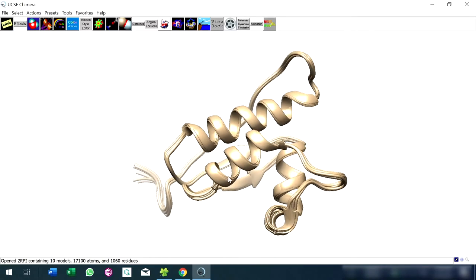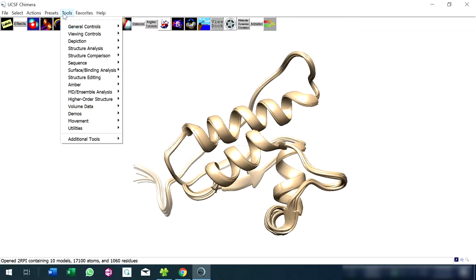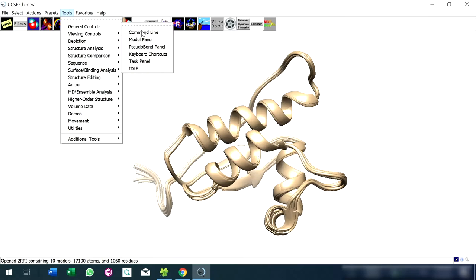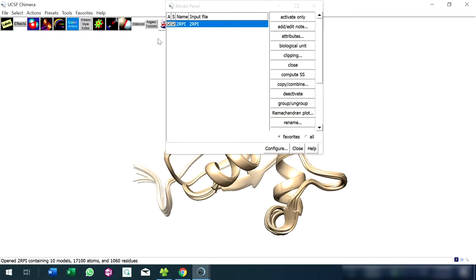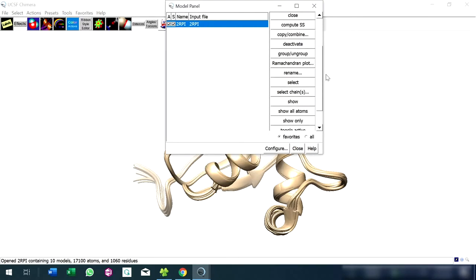Then go to Tools, General Controls, and Model Panel. Select the protein and click Ramachandran plot.